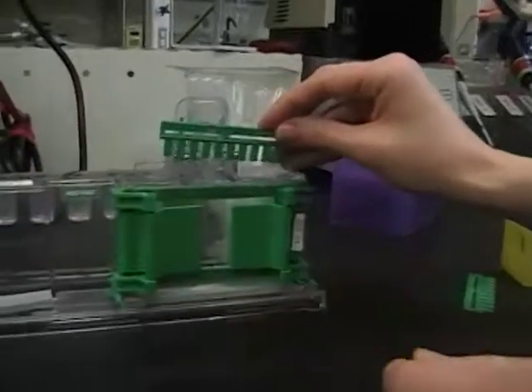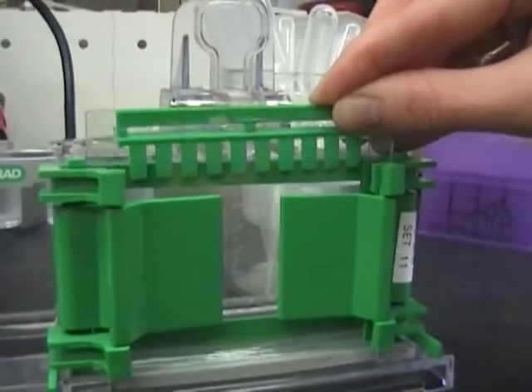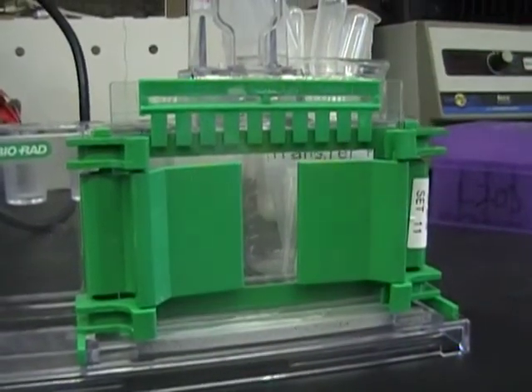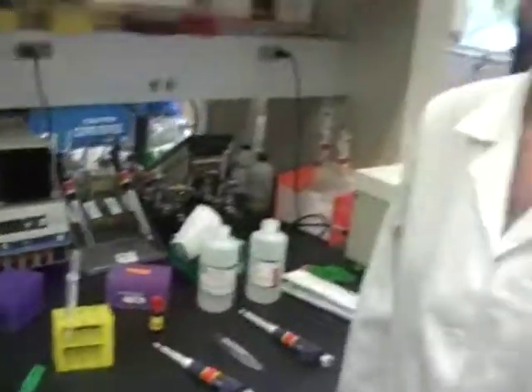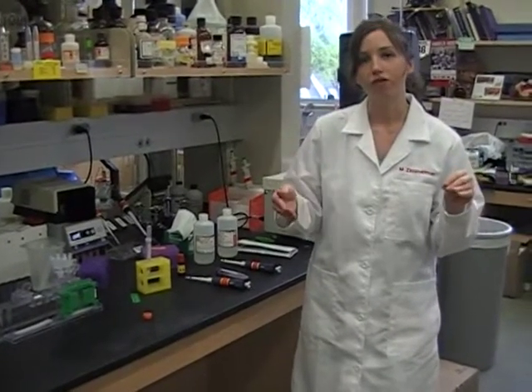Once all your air bubbles are done, you can go ahead and put the green comb in. Double check for any air bubbles that remain. If there are no air bubbles, you can go ahead and let your gel dry. It'll take about 45 minutes for the gel to fully polymerize. If you plan on using it right away, you can go ahead. But if you want to store it, just take a little Ziploc bag, put about one milliliter of running buffer in the solution, Ziploc seal it, and put it in the fridge until you're ready to use it.